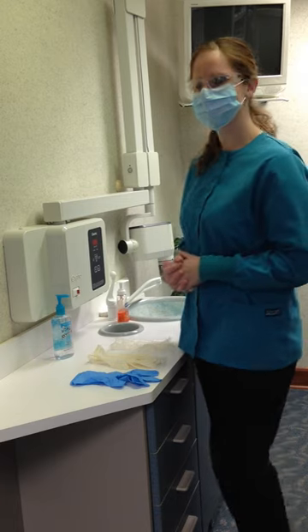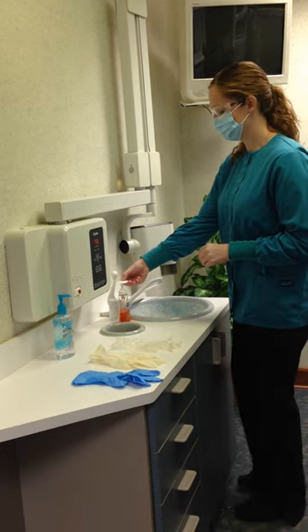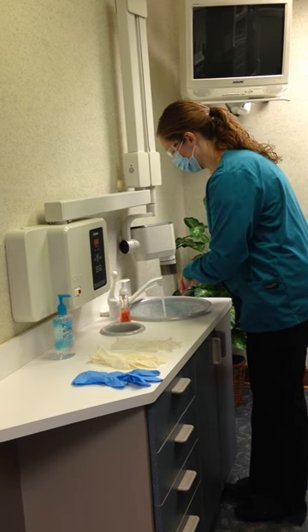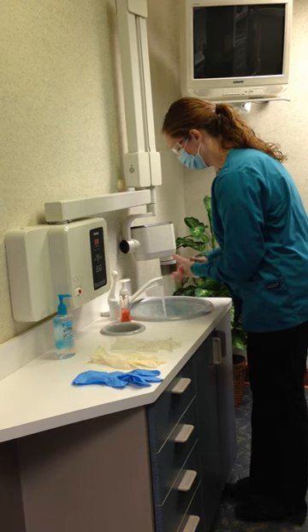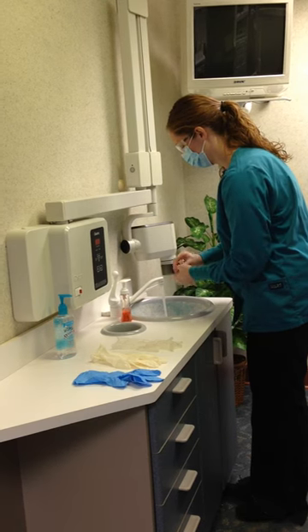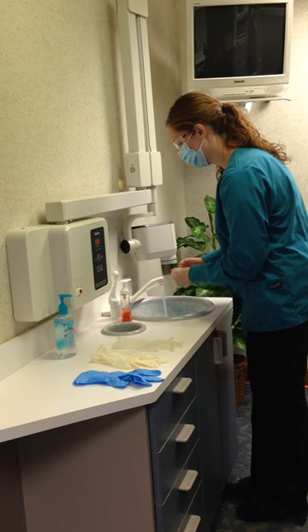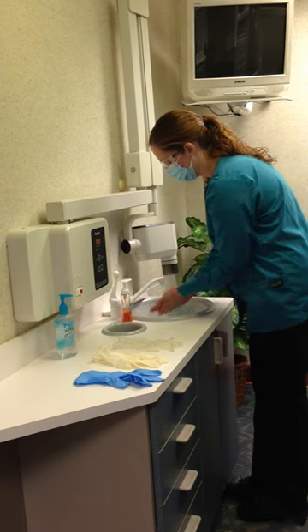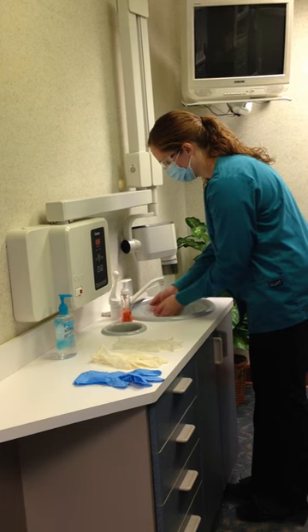They are relatively inexpensive. They are clean, but non-sterile. A variety of sizes are available, usually varying from extra small to extra large. They are made to fit either hand. A glove that is too large or too small could be uncomfortable or cumbersome to wear. The dental assistant will select the size that best fits their hands and fingers.